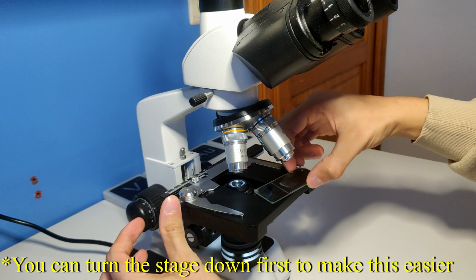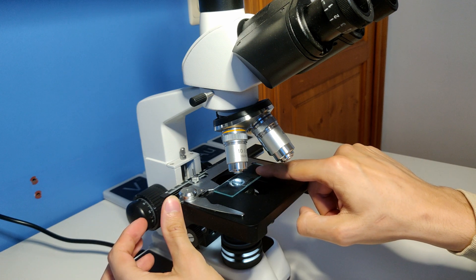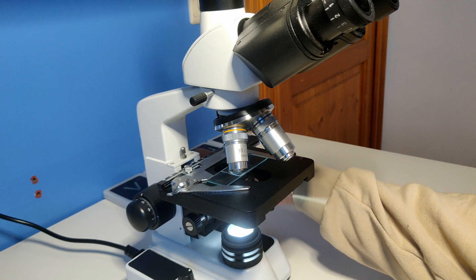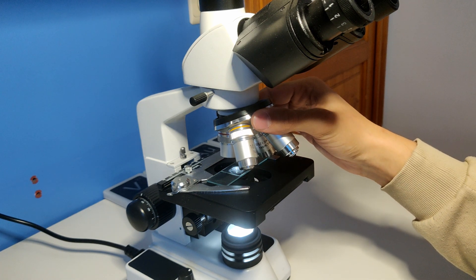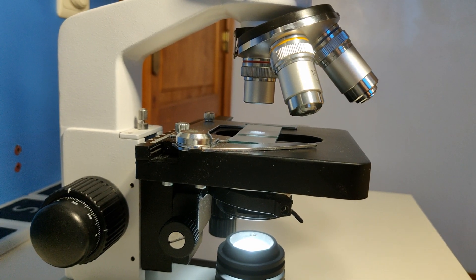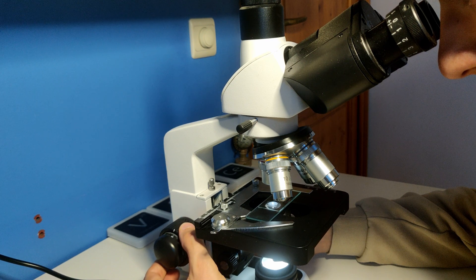Clamp the specimen between the stage clip and the metal borders. Make sure to not clamp it under the clip. Next, turn the stage all the way up. Start at the smallest magnification to get an overview of your specimen. Make sure that the objective lens does not hit the specimen — this is normally not possible if you start with the lowest magnification. Turn the stage down with the coarse adjustment until the specimen comes into view.